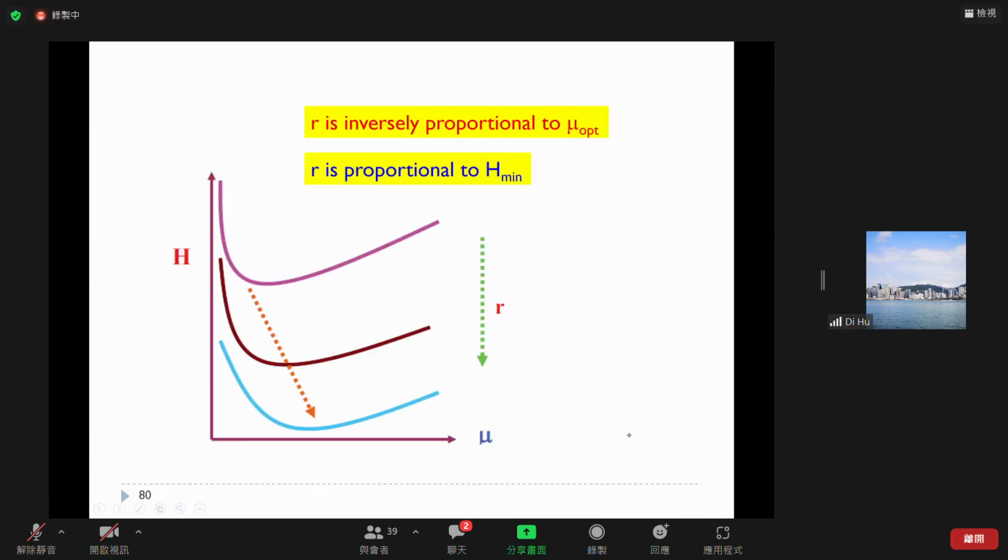And for this one, this shows R. R here is not the particle diameter. Okay, dp is the particle diameter. Now I'm talking about the column radius. The reason for me to put it here is that I just want to point out that this is the optimized flow rate, and it is inversely proportional to the radius of the column, especially for capillary GC.